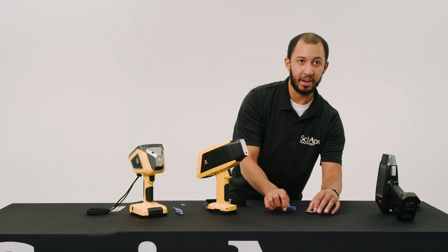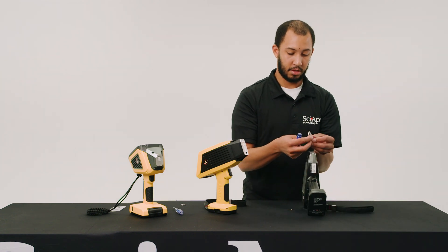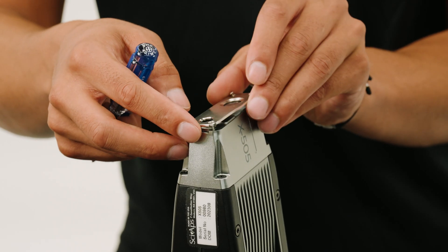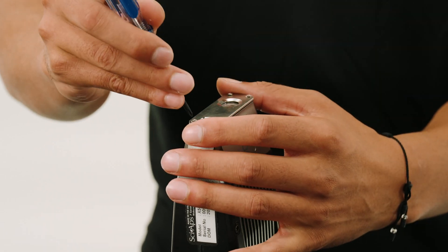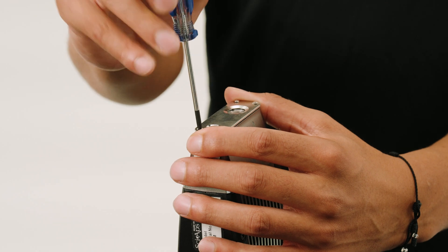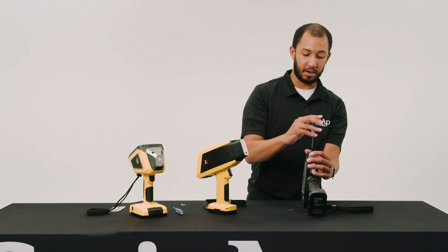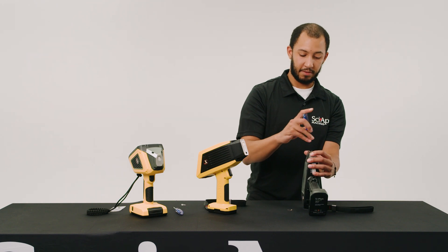Just like that — make sure it's sealed and flush. We'll put it right back on this unit. Just make sure everything is sealed and flush. You don't want any contamination because this will affect your shots.